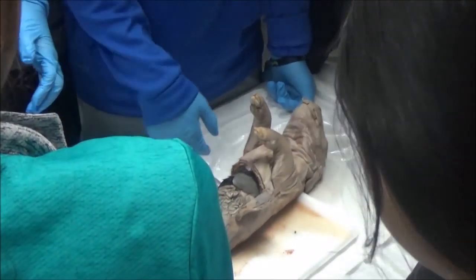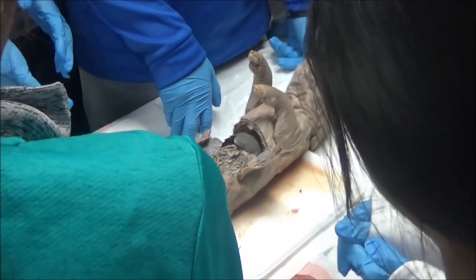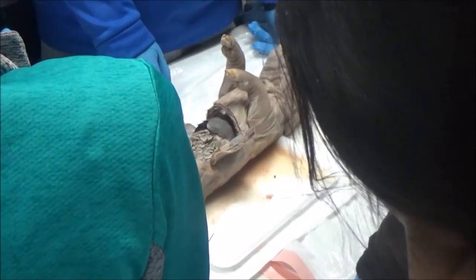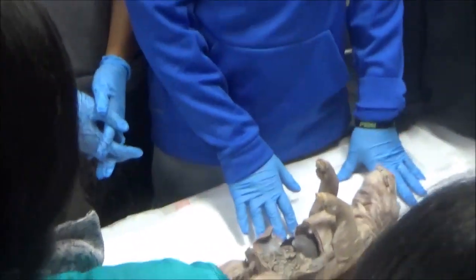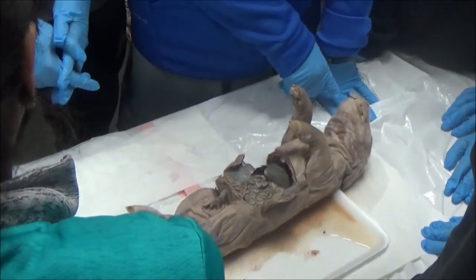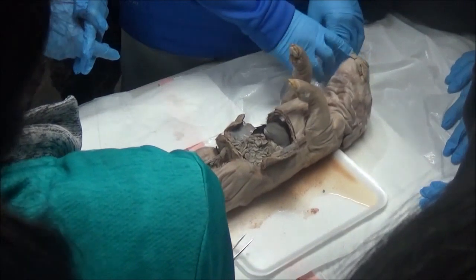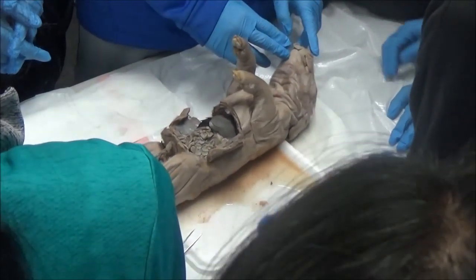We'll be dissecting the pig over multiple days. At the end, you will all get your own pig to work on together in small groups of four. So this is the group pig and then we'll get individual pigs closer to the end of the semester.